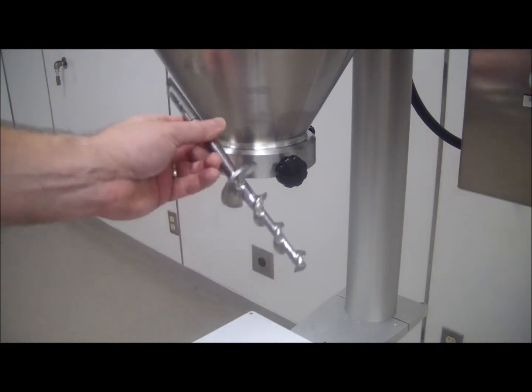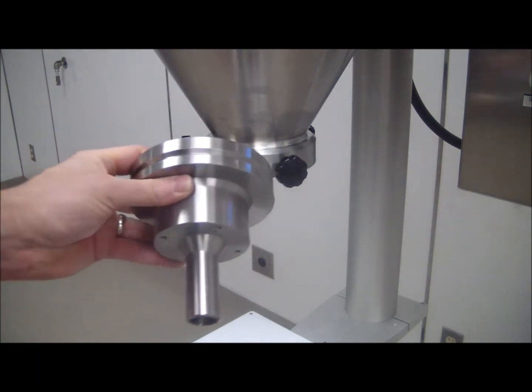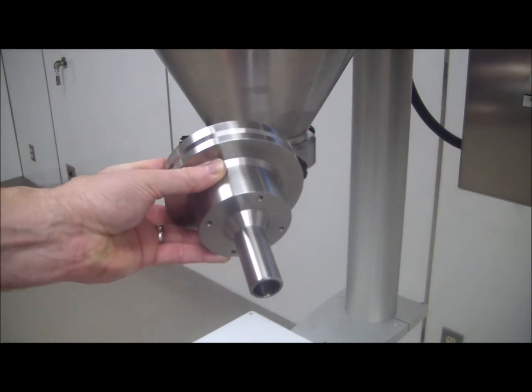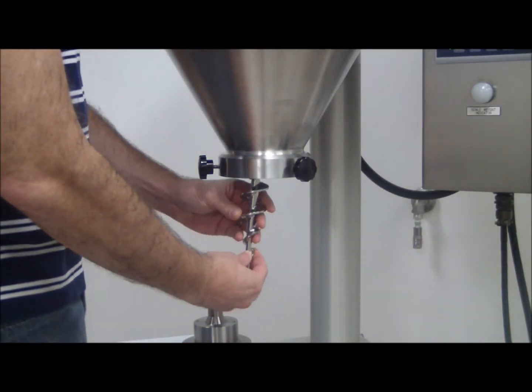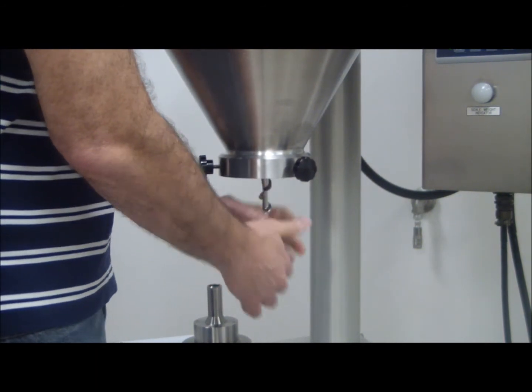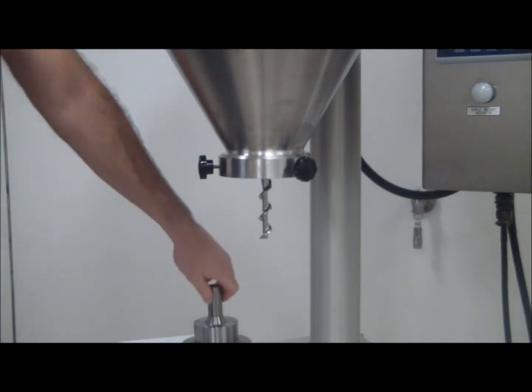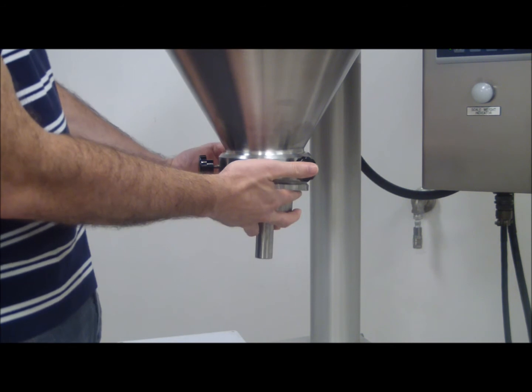When you're ready to fill a different product or clean up, our toolless changeover makes it easy. Loosen a few hand knobs to remove the funnel and hopper, and then you're good to go. We have tooling sets specifically designed for your product. With our 43 years of application knowledge and extensive database, it's more than likely that we've already filled your product.